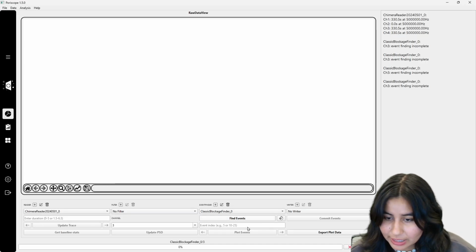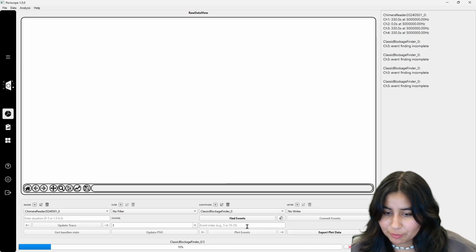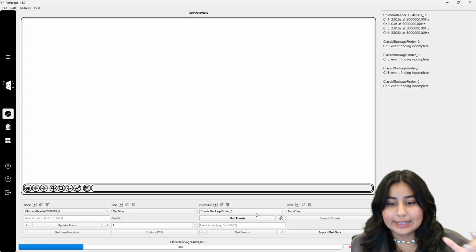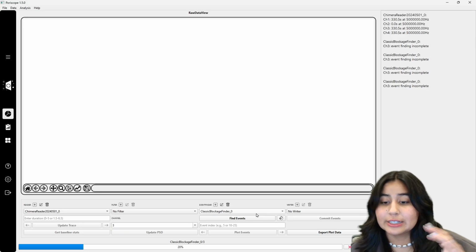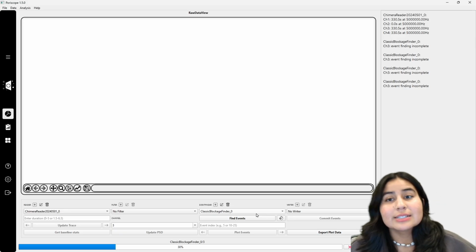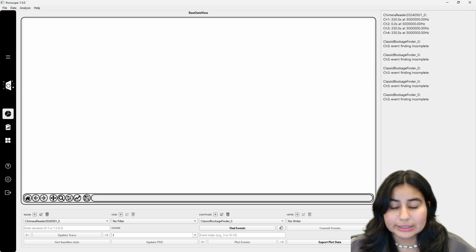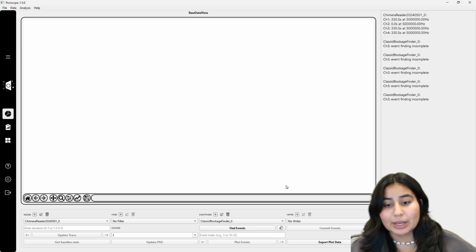So let's look at that. It was not there before, but now it's there. It's the progress area, which is at the bottom. In this case, it's only one progress bar. It could be multiple. We'll see how that works later on. But as you can see, it dynamically shows when you need it, and when you don't, it disappears. But it's an element that composes the main view, so I wanted you to be aware of that.